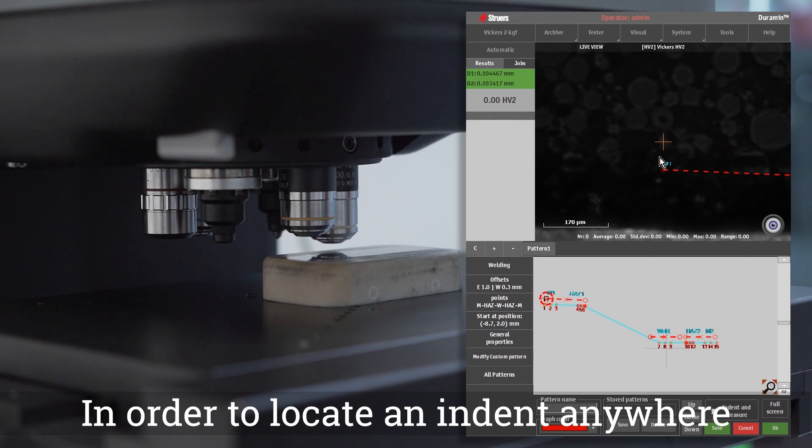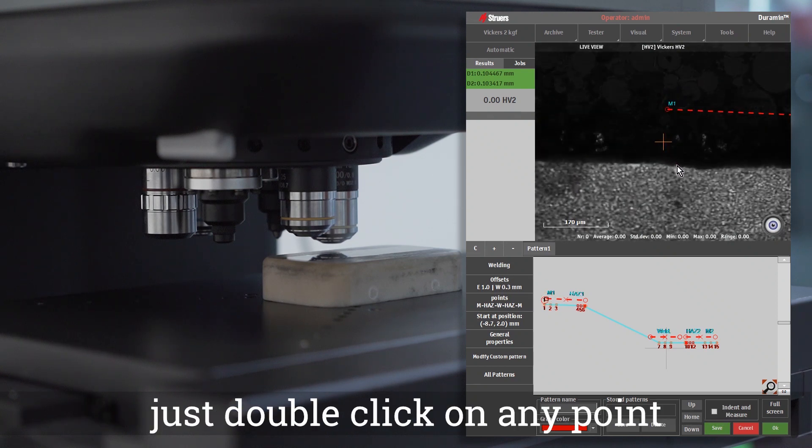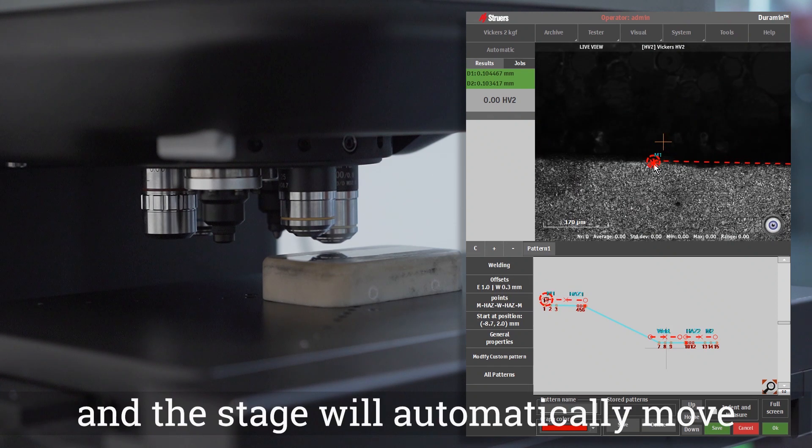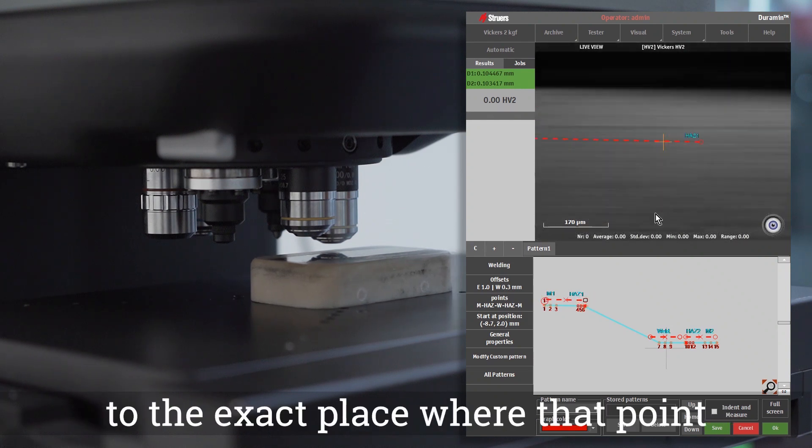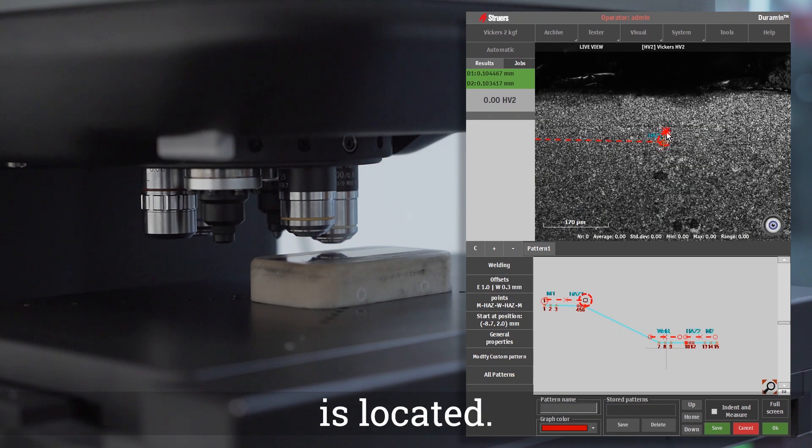In order to locate an indent anywhere, just double-click on any point in the test pattern and the stage will automatically move to the exact place where that point is located.